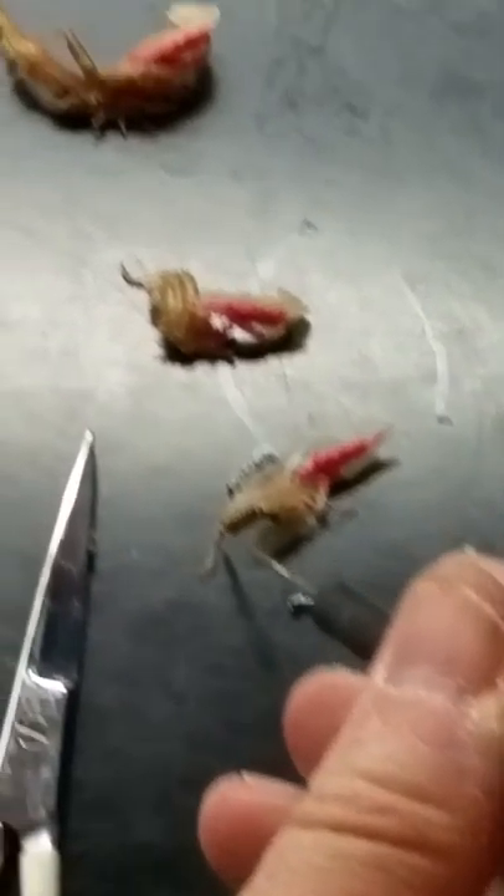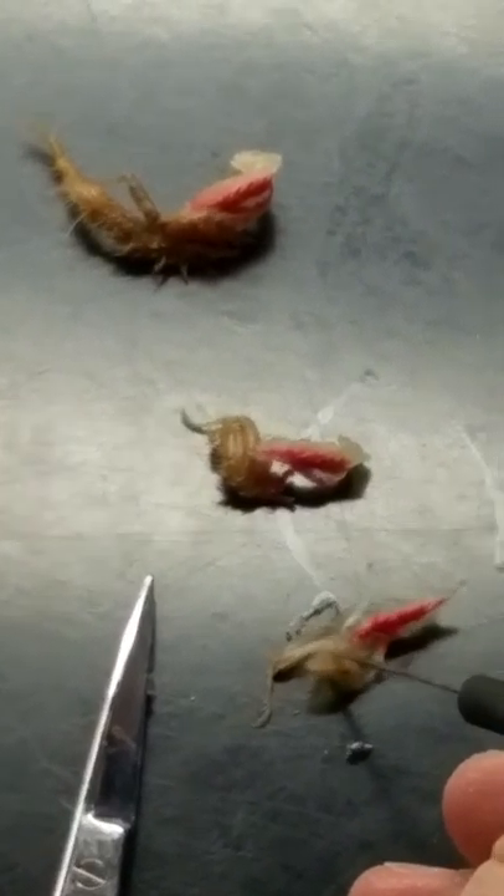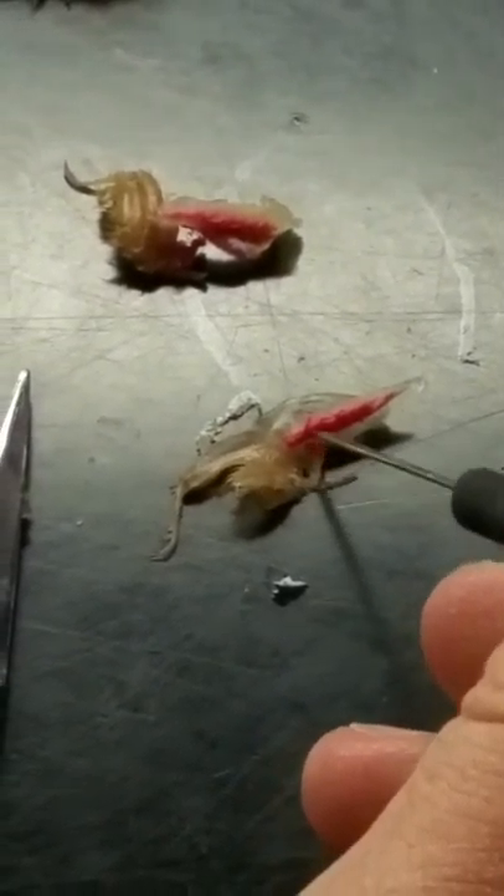There's the first maxillopod, and here's the antenna-like exopod. There should be a little finger-like structure, which is the endopod, and most of the back portion here is all protopod.